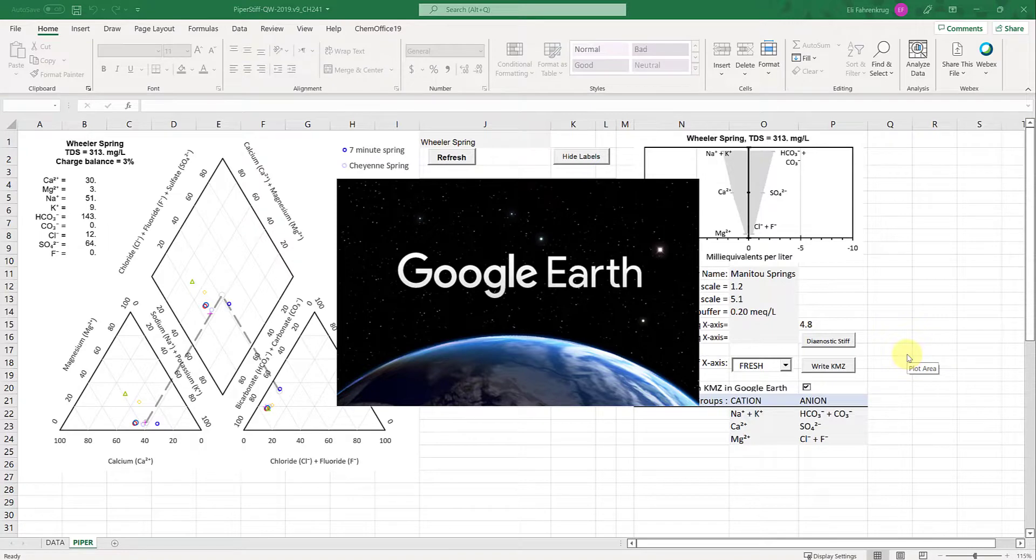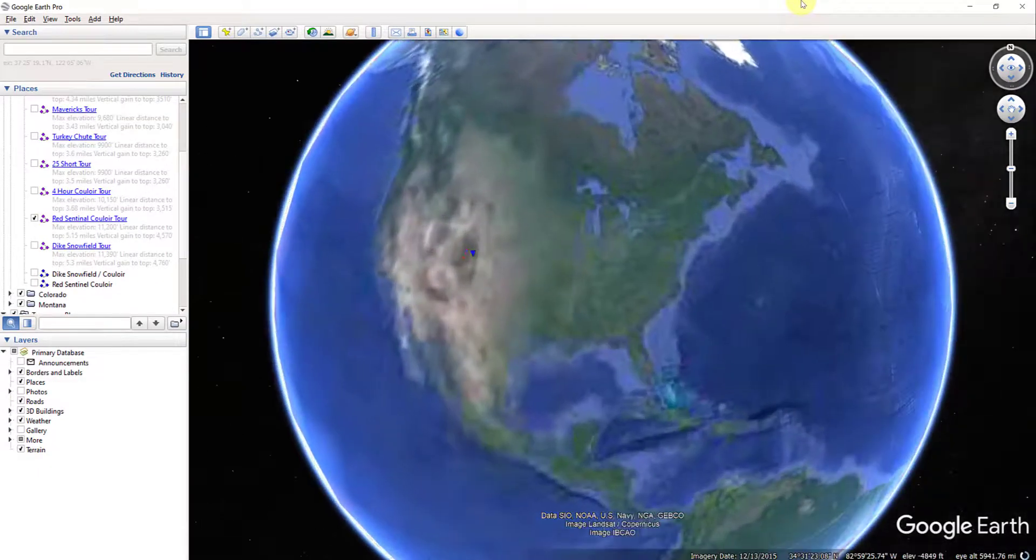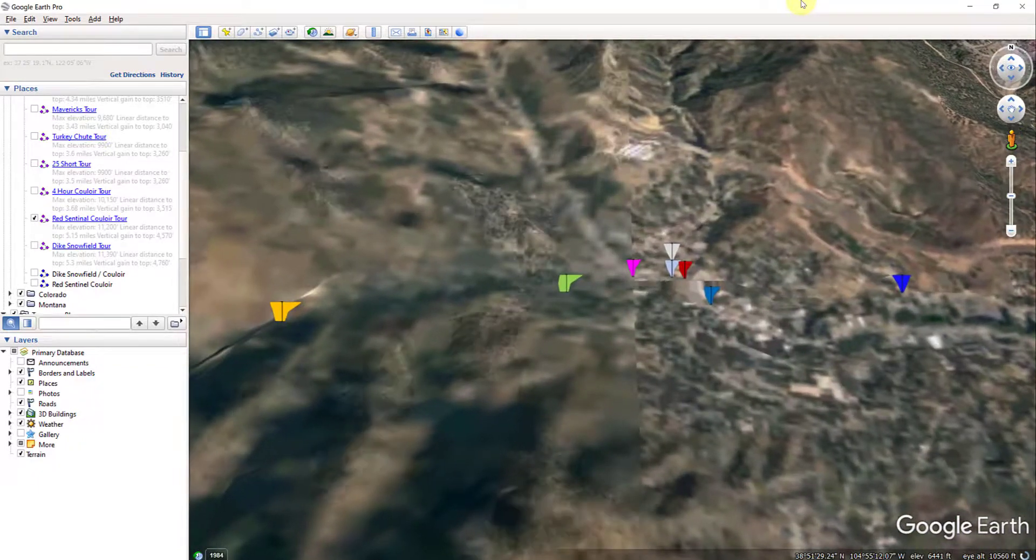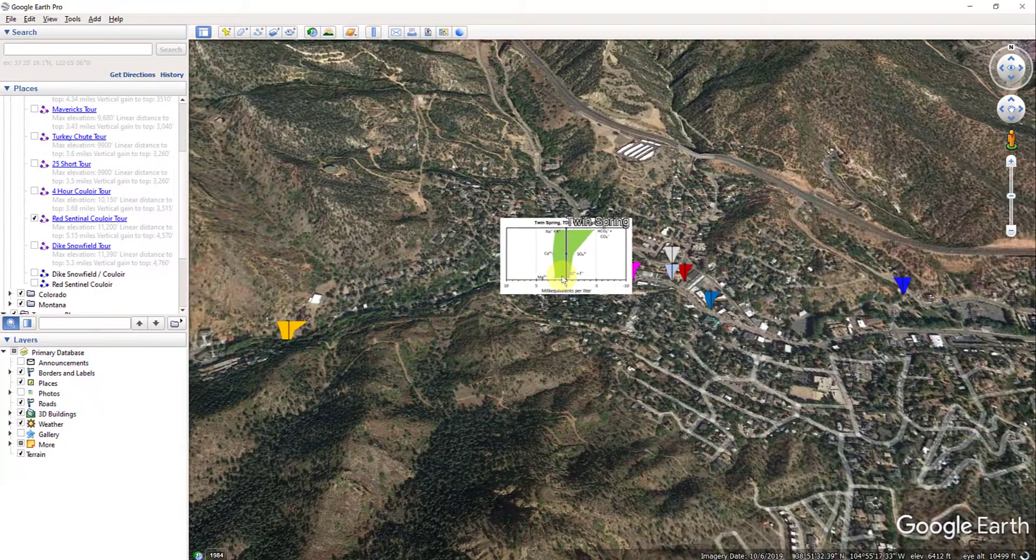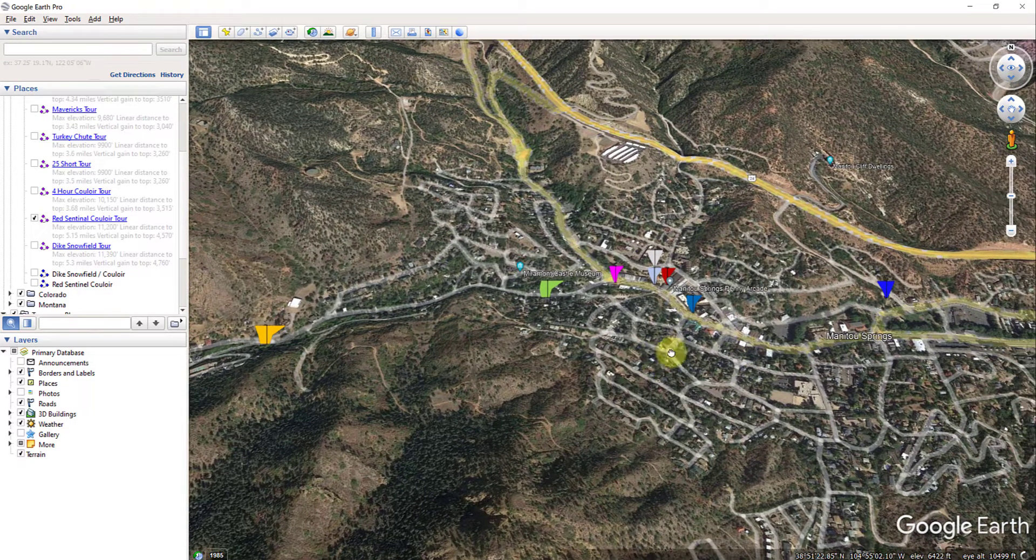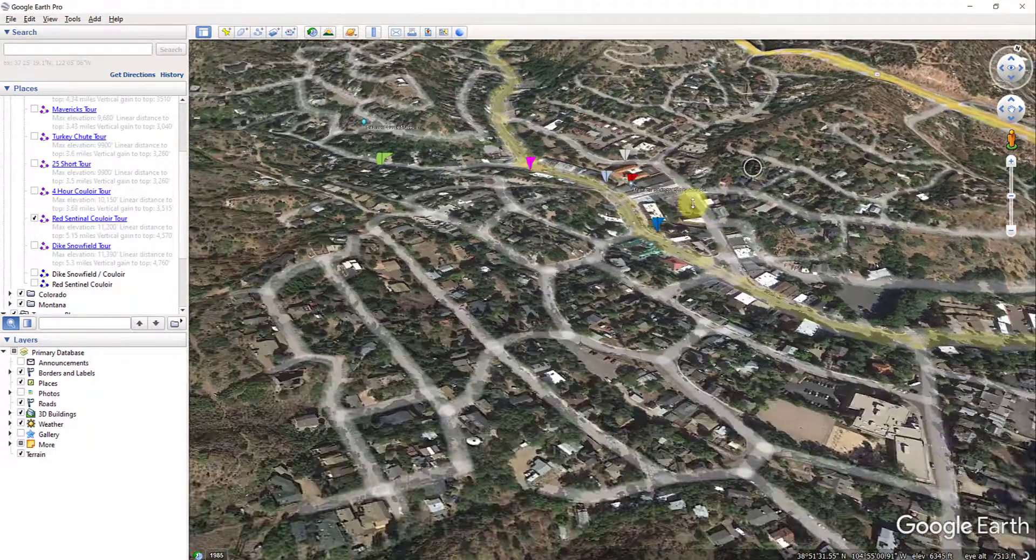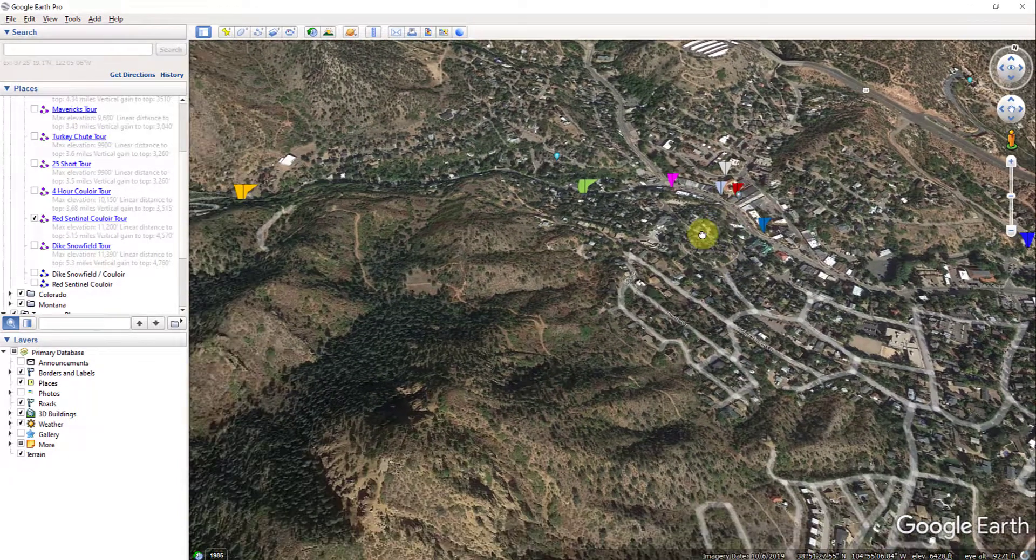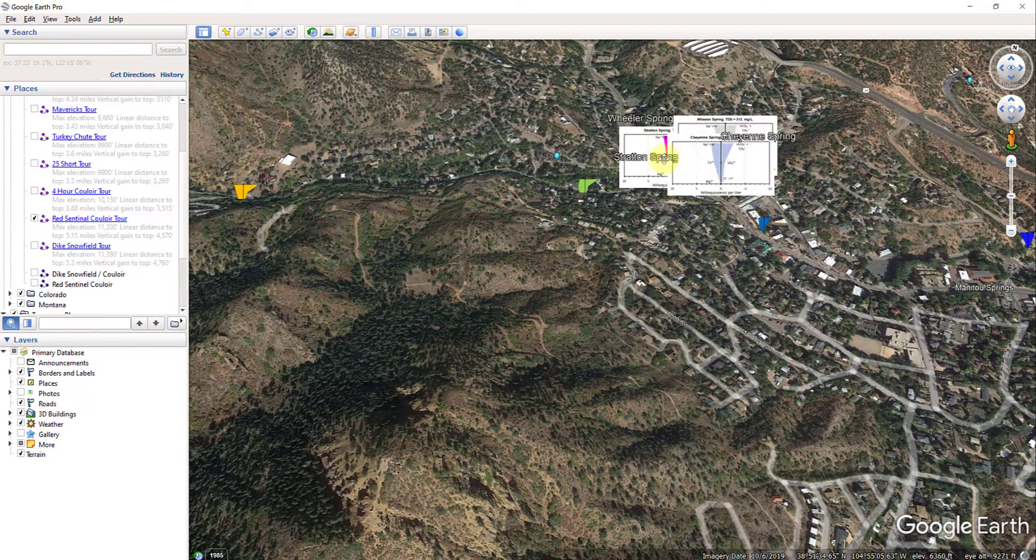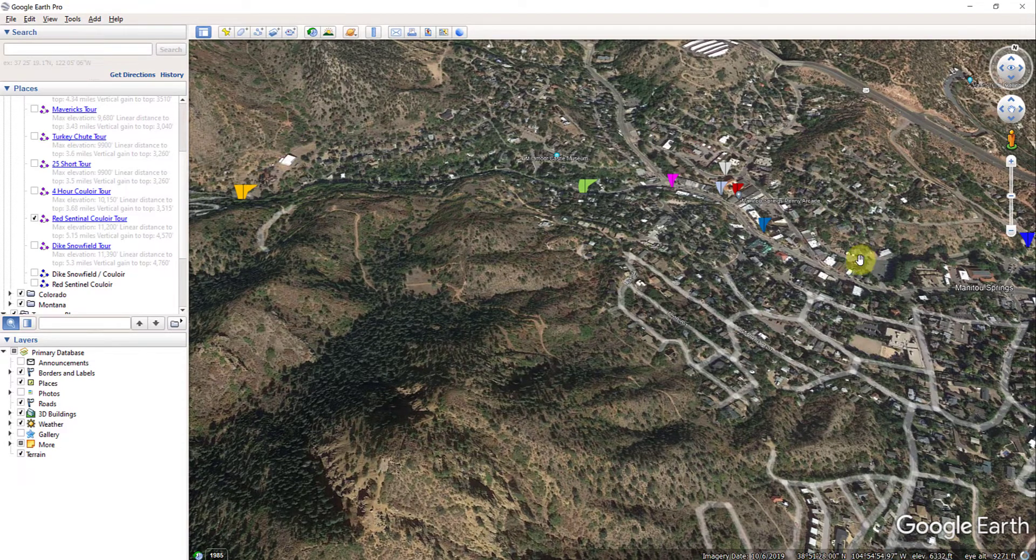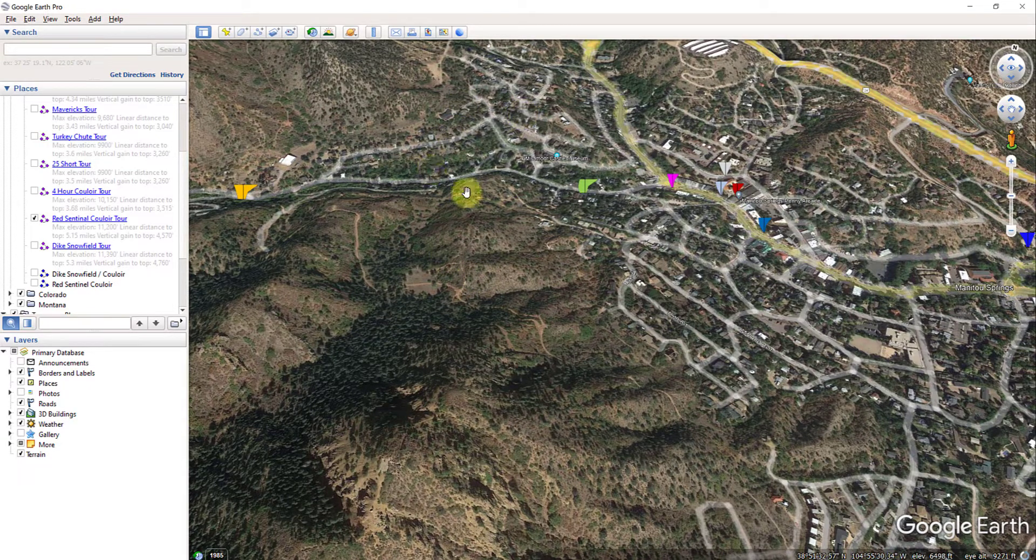It's going to go through and do some stuff, then you can see it pull up Google Earth automatically. It's going to import that kmz file, it may take a little bit of time. It's automatically going to draw me to the location of those sites, and now each of these individual icons is the stiff diagram for the spring. This is Manitou Springs. I can move around, zoom in, rotate, and quickly get a look at how the chemistries are changing as a function of location.